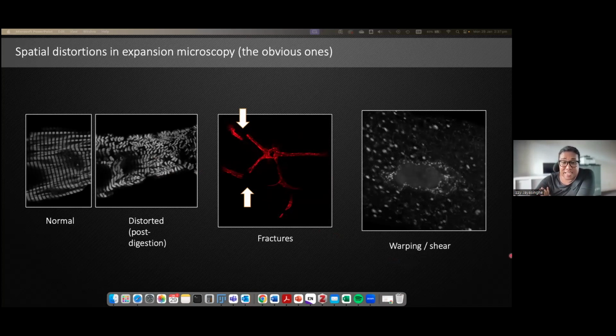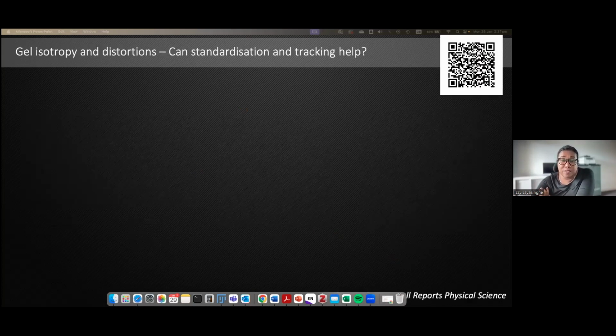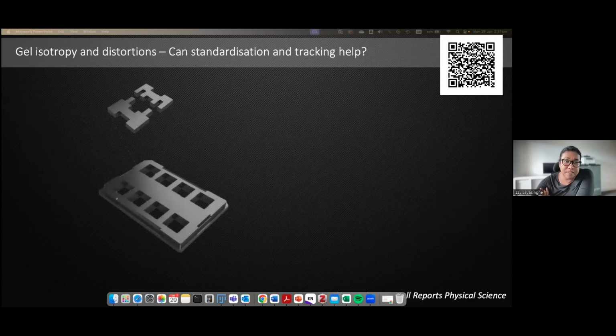One of the things that unlocked closer examination of this for us was trying to adapt 3D printable structures to our experiments. This work we published at the end of last year. This is a 3D printed microplate.